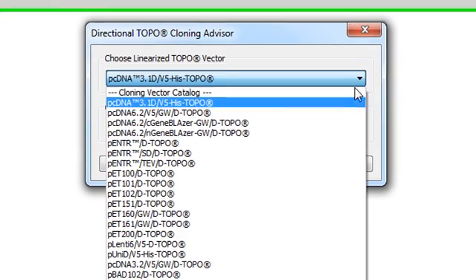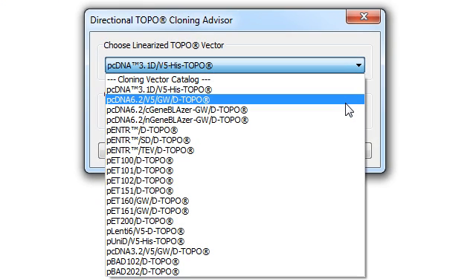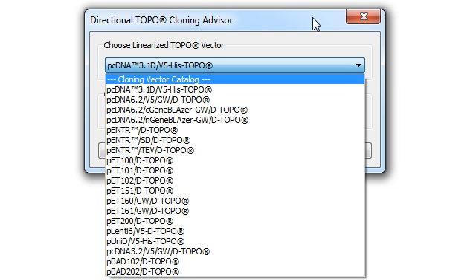Now the vectors that are listed here are coming from the vectors catalog that's installed with your software. And these all already have the 5' GTGG overhang and the blunt 3' end, which is necessary for the directional TOPO cloning reaction.